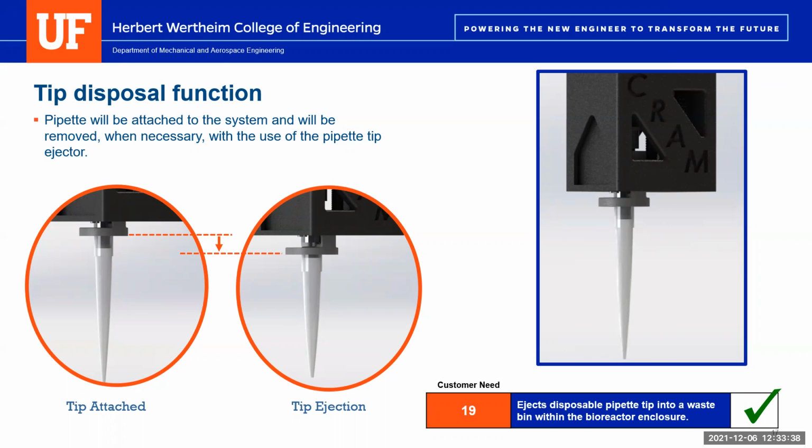But yeah, definitely the required positioning tolerance is going to play into your XYZ system and also whatever is holding those pipettes in place and how much wiggle room that gives the tip. They would need that tolerance to be able to get the pipette itself over whatever test tube they're using too. So I think it's a double edge. If they're able to get it over the test tube, they should be able to align the pipette with the receiver. Maybe.